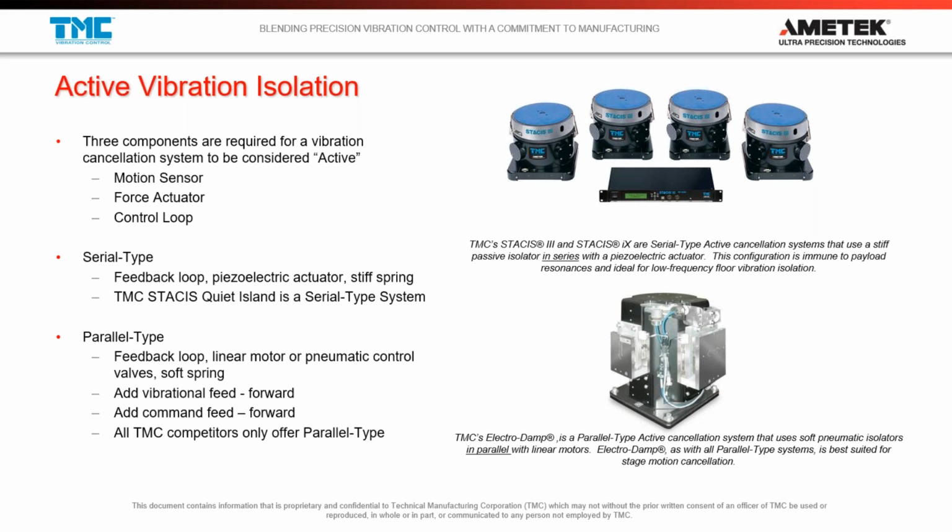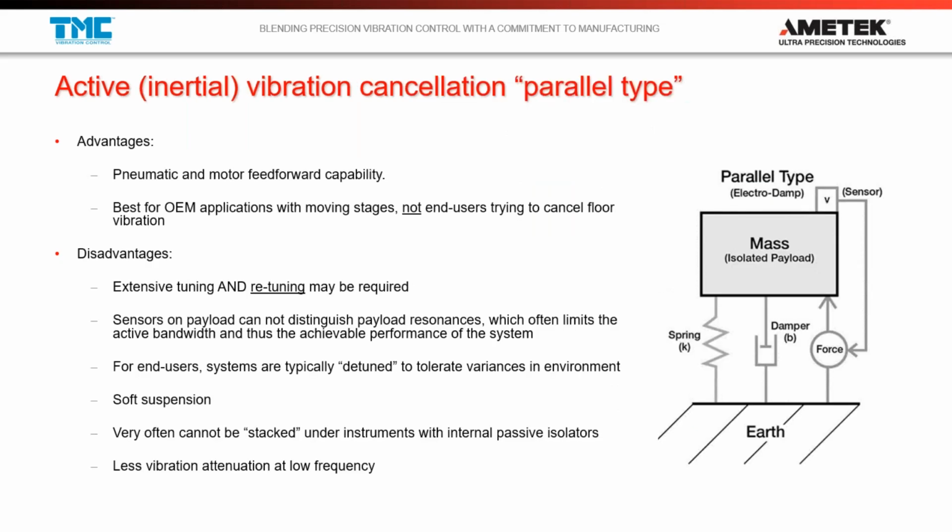And then we can take these components and divide them into 2 different types of systems and configure them in different ways. We have serial type systems and we have parallel type systems. I'm going to go, in my next slides, into a deeper dive into the different types of active systems that are out there and how they are used to cancel floor or other vibration.